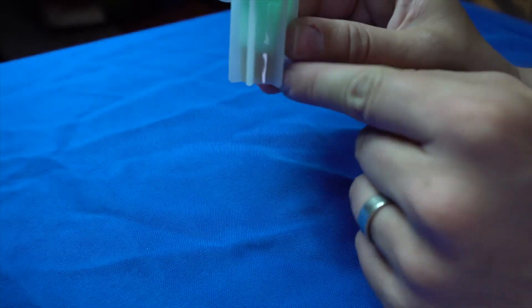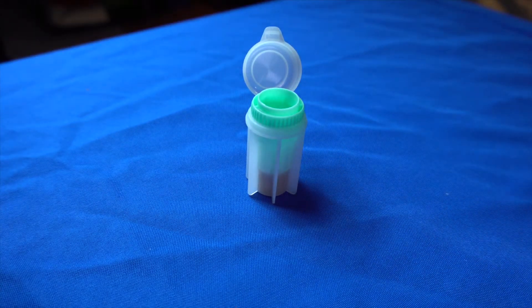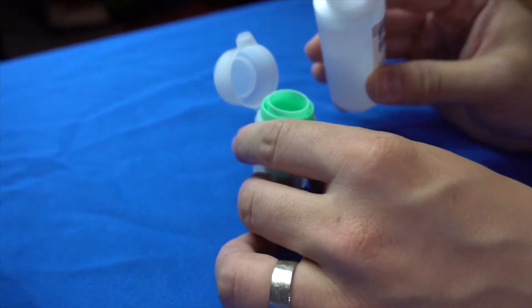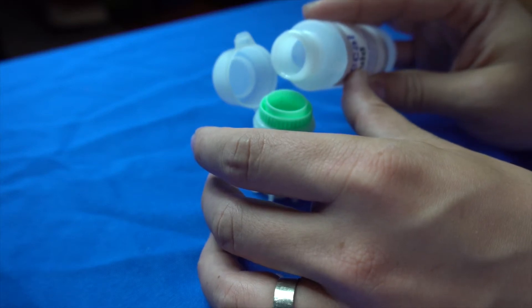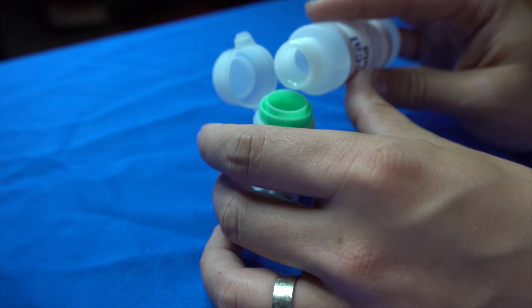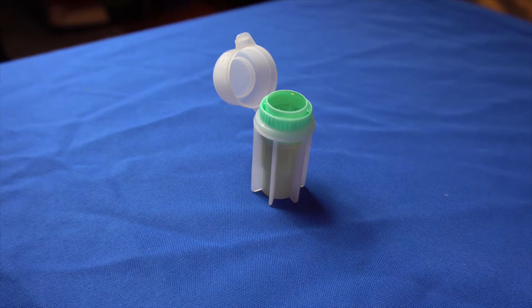Once it's notable that it's actually dissolved into the water, what you're going to want to do is get a little bit more fecal fluid and fill it all the way right to the tip like that. Now I like to let it sit for a little bit so that it can allow some of the material to float to the top. But you want just enough so that it has that bubble, so that it does not overfill but it's easy for you to get it onto your slide.